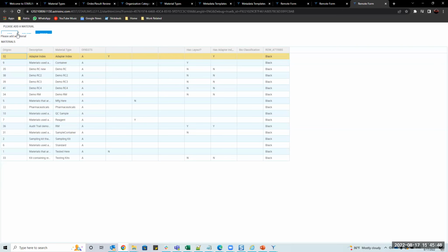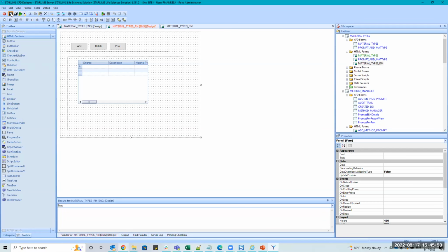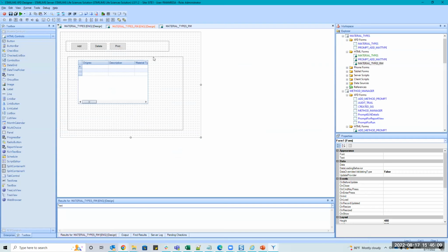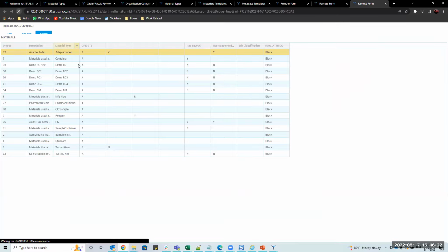Okay, so it's looking all messed up now. So let me get rid of this. Let's go back. Oh man, we're like out of time. Now you see there, it's getting there, but by adding the text properties, I'm getting some overlap. So I would probably do a bigger padding. Try 15. Yeah, let's see what it looks like.